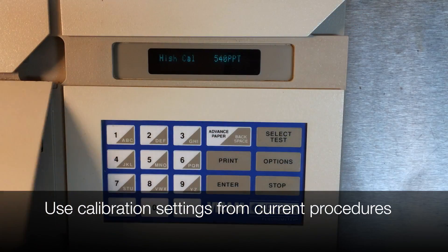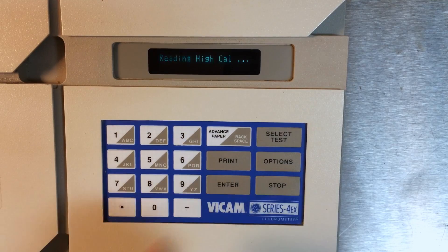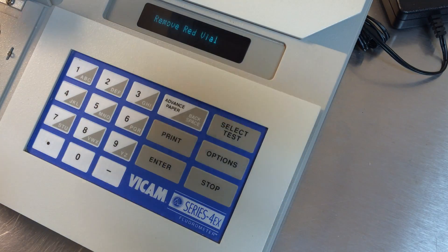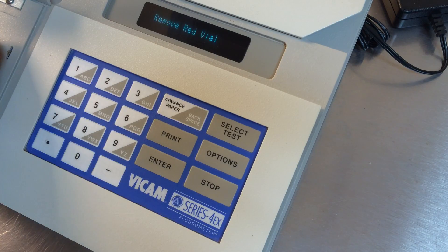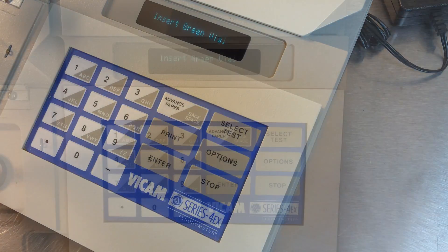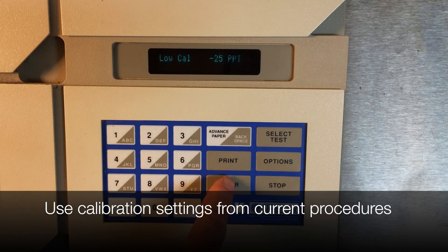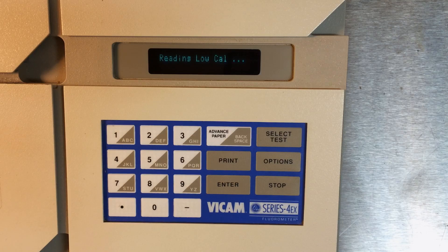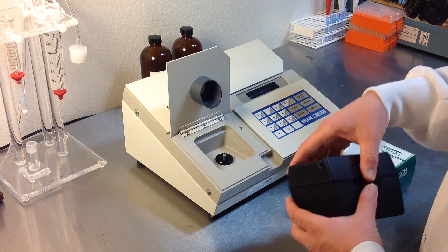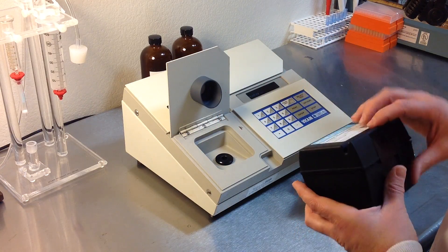Use the keypad to set the calibration number to the value noted in the current procedures manual. Press Enter. When prompted, remove the red vial and insert the green vial. When prompted, remove the green vial. The machine will print a time-date stamped record of calibration.